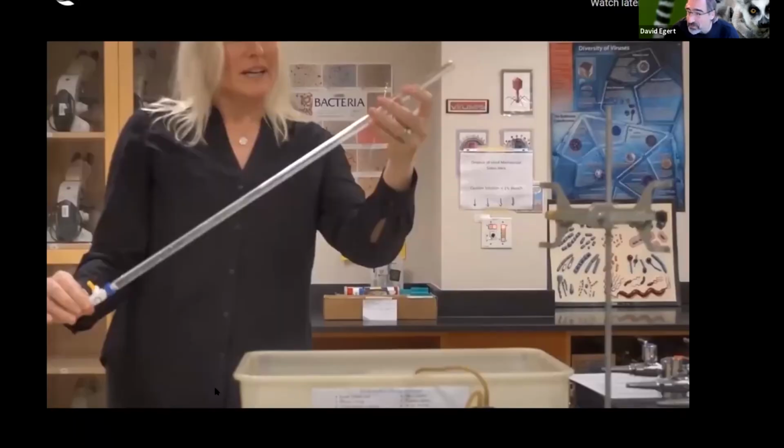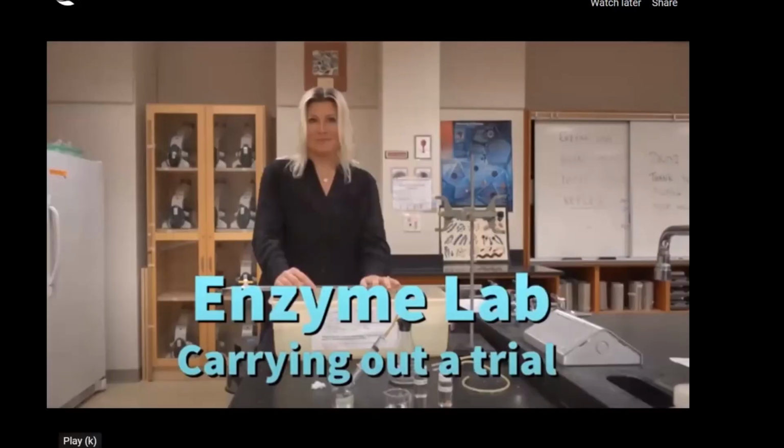Performing a trial. Okay, so the first thing we need to do is fill the burette with water. And just so you don't make a big wet mess on the floor or someone's pants, make sure the stopcock is turned this way. Sorry, we can't see your screen. Yeah, we can't see it. You can do this over at the sink, but yeah, oh, that's funny. All right, let me try that again. Sorry about that.